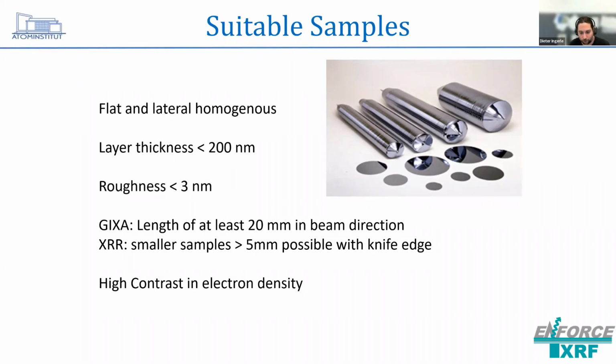I mean, for quartz reflectors, it's of course typically no problem. Also for wafer pieces, we have them typically larger. But as I said, if we do some multi-technique analysis, it can be sometimes problematic because other techniques might require smaller samples. So yeah, sometimes this was difficult.